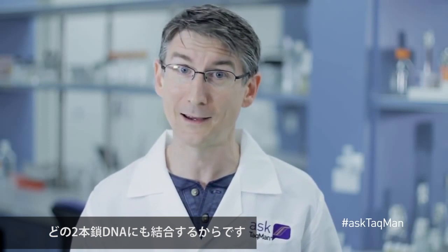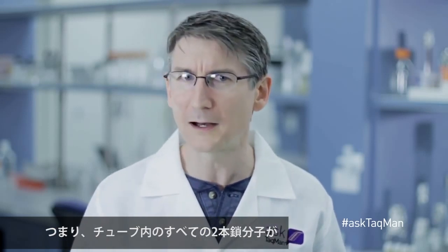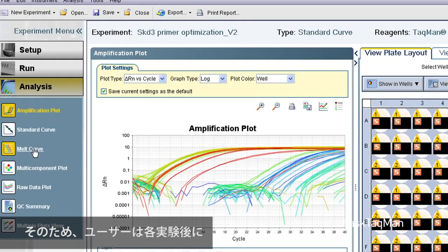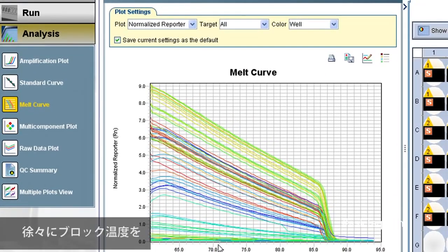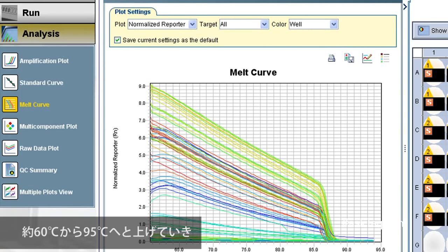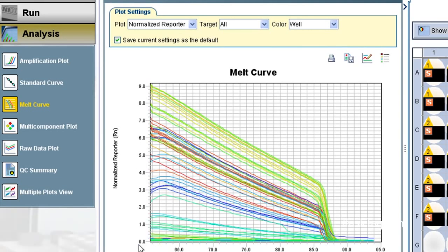That's because SYBR Green dye binds to any double-stranded DNA, meaning every double-stranded molecule in the tube will bind SYBR Green dye and add to the fluorescent signal. Because of this concern, users run melt curves after each experiment. They do this by slowly raising the block temperature from about 60 up to 95 degrees Celsius and monitoring fluorescence.